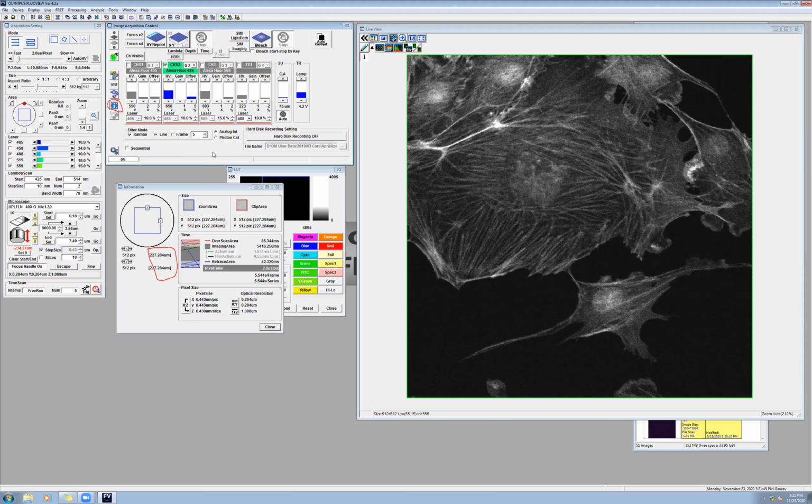So that's that. The other thing is, I'll talk about a few of the things other time, but let's focus on the other parts. If we look at the optical resolution, this is what the Olympus people provide, which is the best optical resolution that you can get: 200 nanometers.